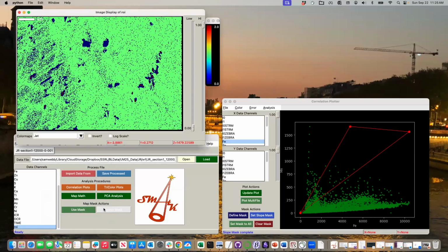If I ignore this, you'll see that the first mask is a bunch of ones, where I have no mask is a 0, and where I've masked this out are now 2s, I hope. Yeah, 2s, it's hard to see. 0, and it goes by powers of 2 as I mask these along. So I could have overlapping masks. If I had a 2 and a 1 that overlaid, it'd be a 3, right?